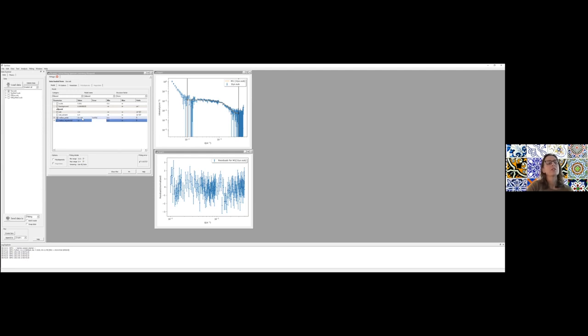Okay. So imagine you had a very large macromolecular complex. You had done, for example, EM, so you know the aspect ratio more or less of your molecule. If the result that you're getting here doesn't make sense, then you can change this by hand to see if you get something that is more consistent with the information you do have already.